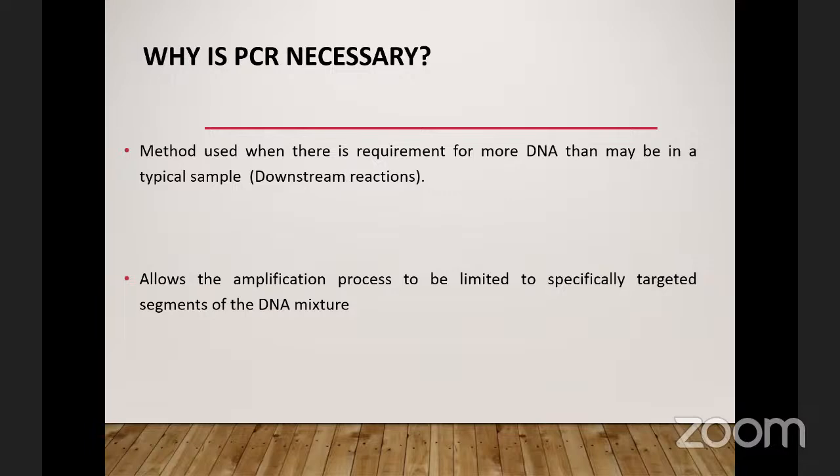And I am able to identify that region. So I can make primers if I want to make diagnosis. For me to know that the parasite is present, I will do targeted amplification of regions that are specific to that parasite that will be in that sample. So if those regions are not gotten from the amplification, then I can say, oh, this organism is not present in this sample. Next slide, please.